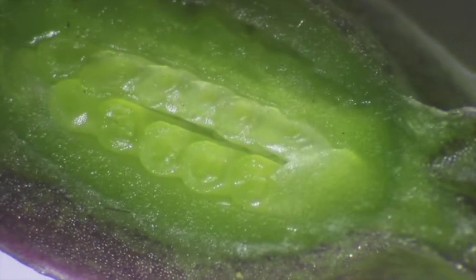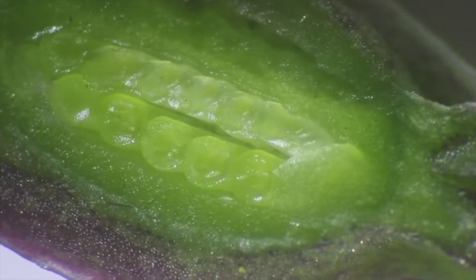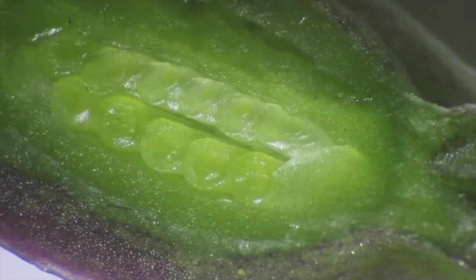So here we are, and then we'll zoom in on this guy here. Inside the ovary are the ovules. So those are all the ovules. So we can clearly see those ovules now. 1, 2, 3, 4, 5, 6, 7, 8, 9, 10 ovules there that we can clearly see. Right? And inside the ovules, that's where we have meiosis producing the spore. And then once we get that spore produced, then we get an egg, right? A gametophyte, then the egg, and then we get fertilization in there, okay?